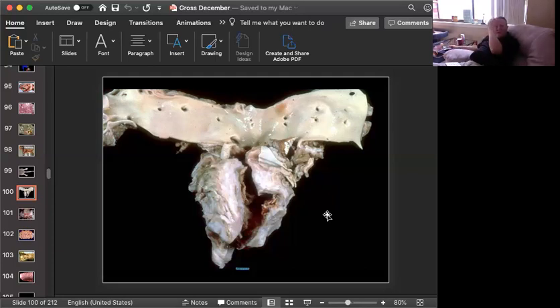If you look real closely in the vessels down here, maybe some of these vessels, you'll see tiny little raised tracts underneath the endothelium, which are previous sites of migration of the larva, but they didn't form this classic lesion, which unfortunately we don't see too much because most of the horses now are on good worming programs. You can still see this in some horses that have been neglected. You can see this in some wild equids, but it's not a very common lesion anymore.